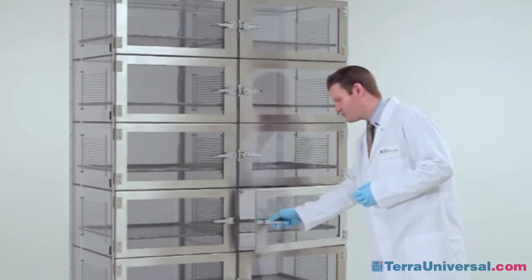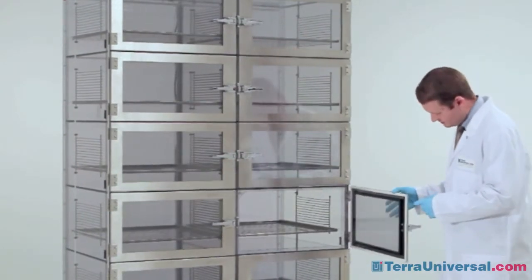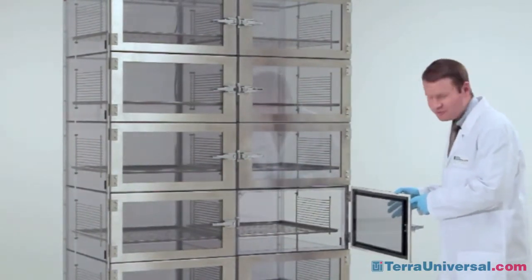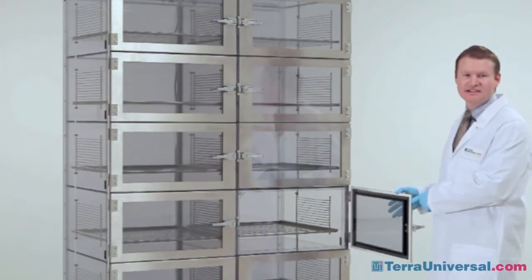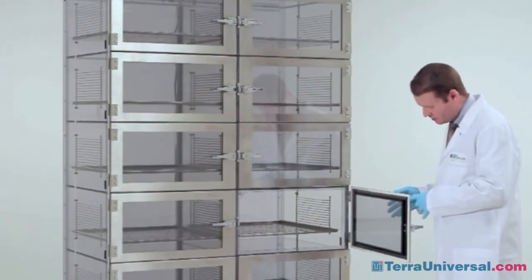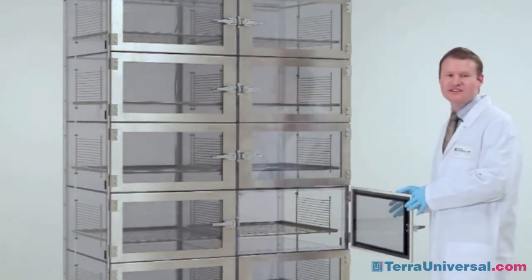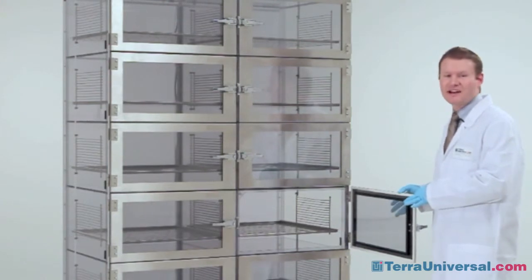Now as I open the door, you'll notice Terra's unique e-profile elastomer gasket. This gasket is not installed with the use of adhesives. It is fully heat sealed and non-outgassing.